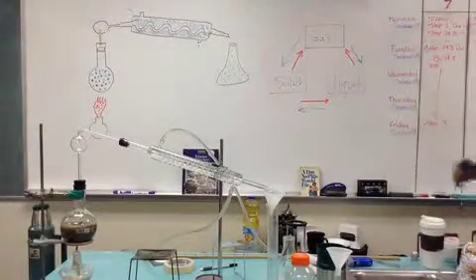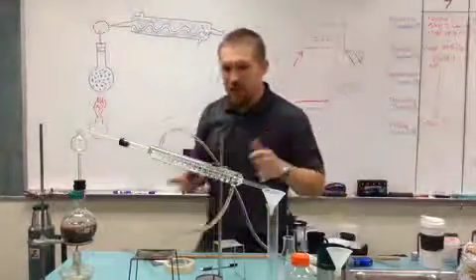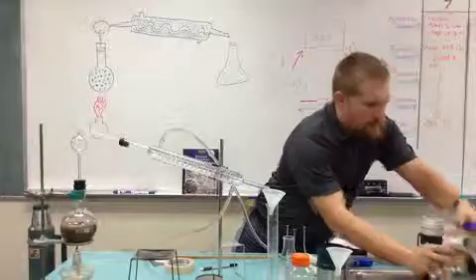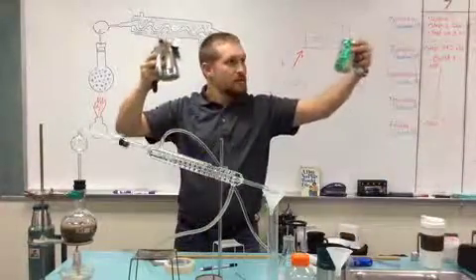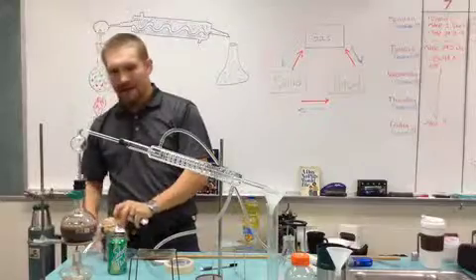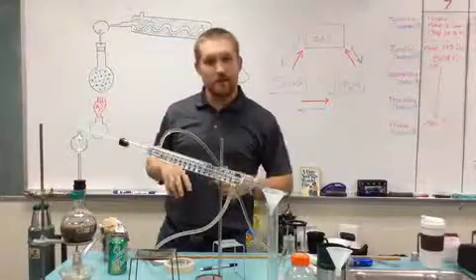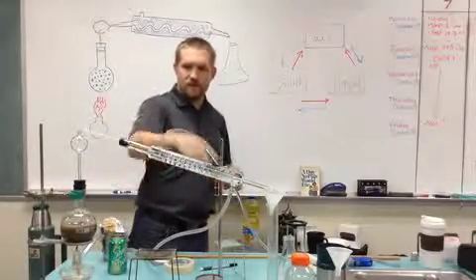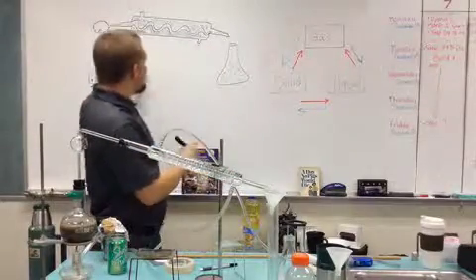Okay, so I'm going to talk just a minute about our distillation process we've been working on. You guys have been using aluminum cans and tin cans. What I have going here is an actual water distillation device. It's called a distillation apparatus. Most of you saw this during class. I'm going to talk about how that works.